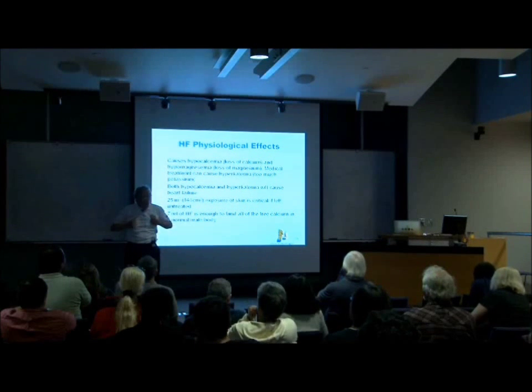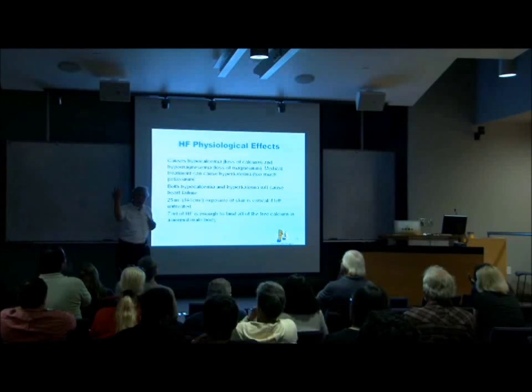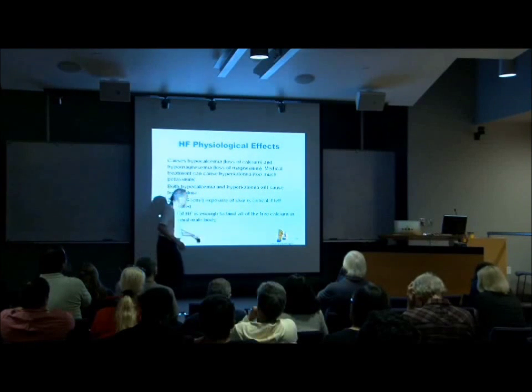You have to get that clothing off, okay? You also have to protect yourself, because if he had hydrofluoric acid, you'll wind up with the same contamination, right?